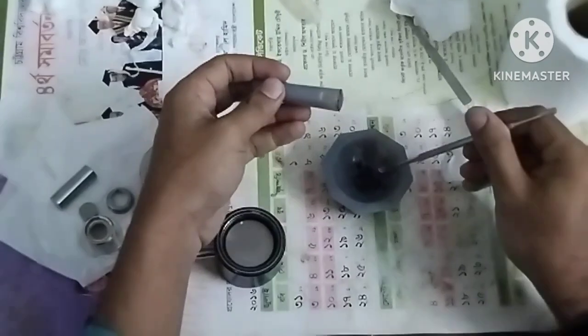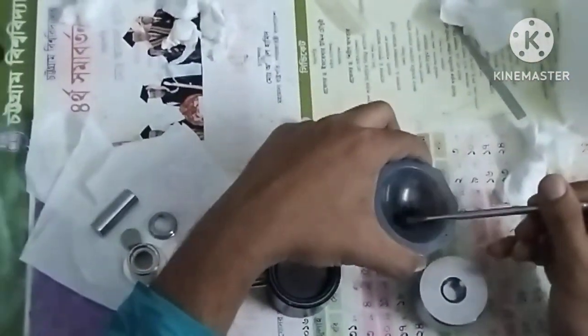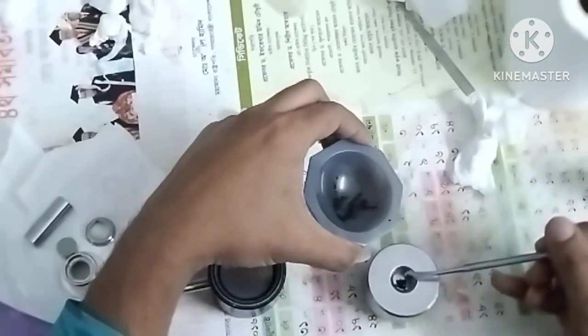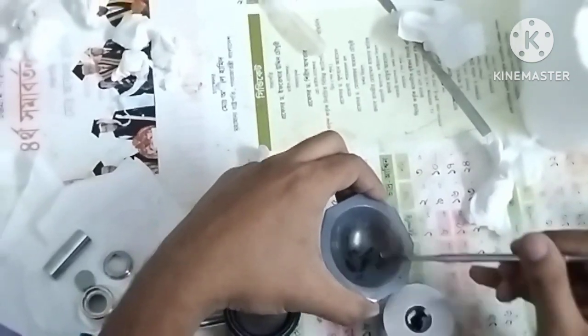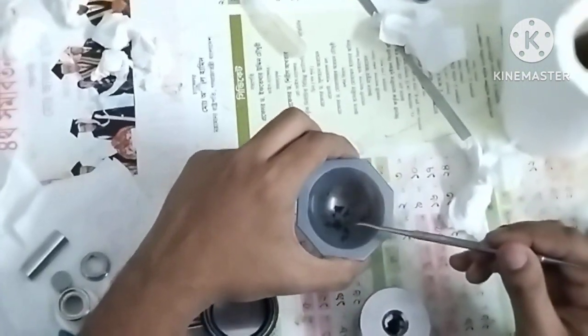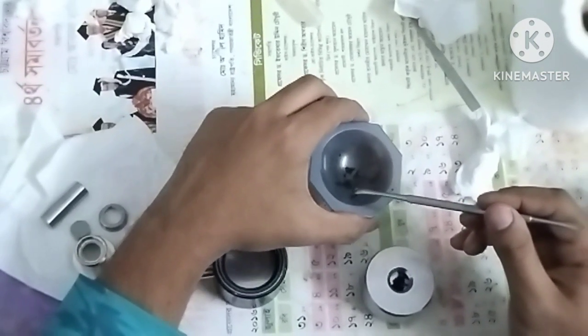We will take an adequate amount of mixture because our KBr plate should not be too thick or too thin. We have to be careful about it, and we will transfer an adequate amount, not very high or very low, because it will create complexity in the IR graph.